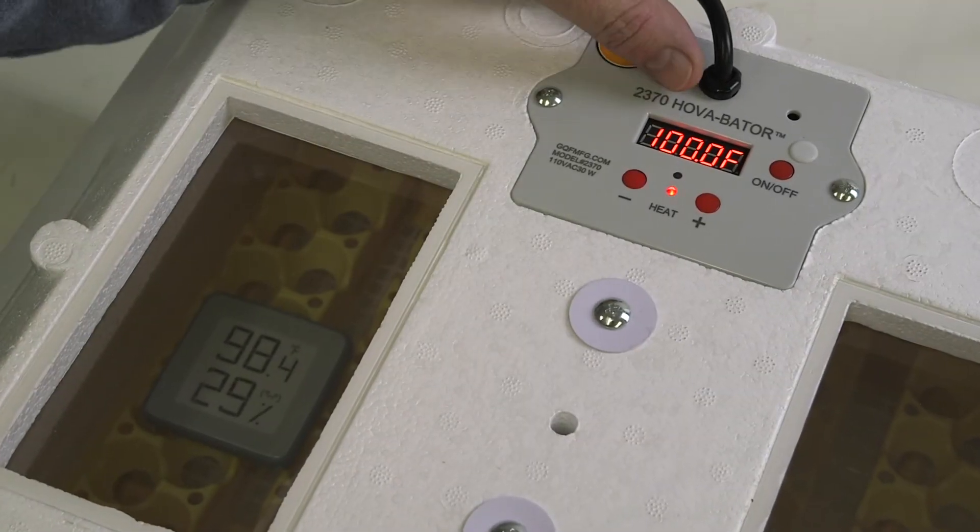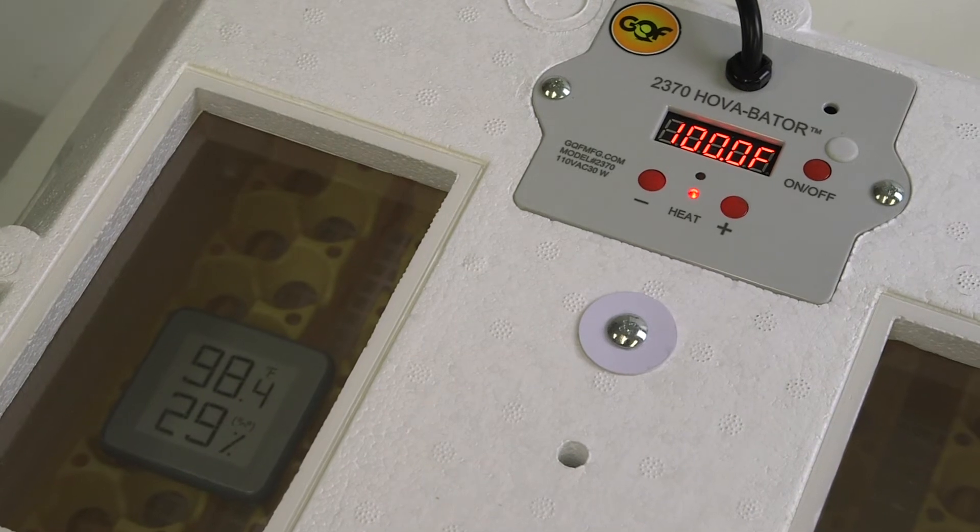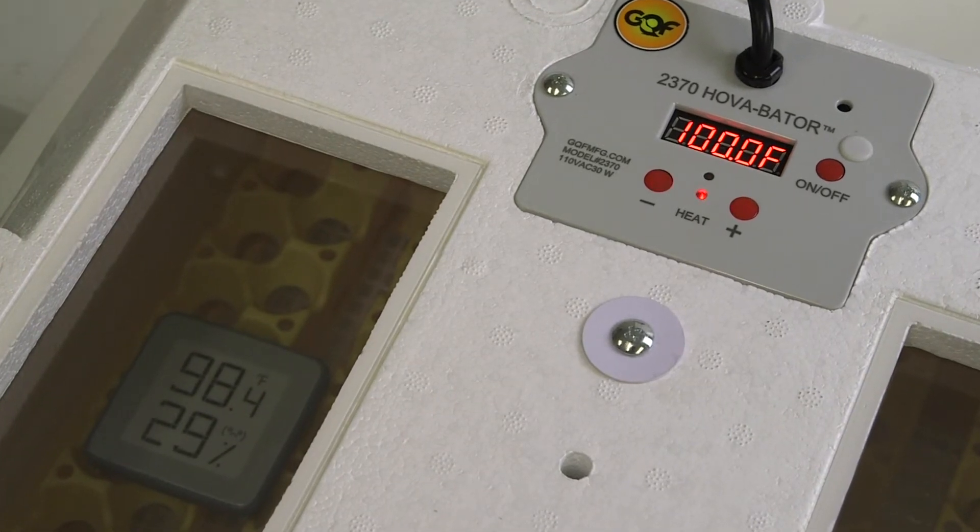On the 2370, you'll notice that the heat light will flash quickly. The temperature sensor is very sensitive as it adjusts the temperature. You'll see it maybe cycle between 100.2 to 100, or 99.8 to 100. That's very close, as that temperature sensor senses the temperature very quickly.